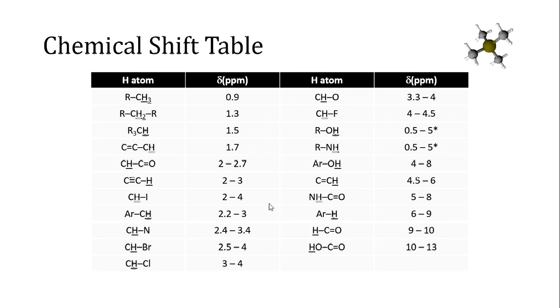If you have a methylene, a CH2, that is allyl, so it's bumped up to around 1.7, but also is attached to an oxygen atom, you can expect that chemical shift to be higher than 1.7 because of the oxygen atom, but also higher than 4, which is the maximum for carbon-oxygen, because of the nearby pi bond. So these things all can add up. Some of the ranges you'll see are quite large.